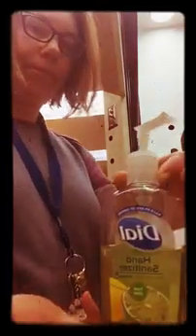And basically, your group is going to test all 4 cleaners. And from the past, what I've done here is I've numbered them. For some reason, I don't see number 1. Oh, there they are. It's just short. So we have number 1, which is the alcohol-free hand sanitizer. Number 2 is just the clear hand soap, not antibacterial. Number 3 is the hand sanitizer with alcohol. And number 4 is an antibacterial hand soap. So each group will grab one of each of the 4 cleaner types.